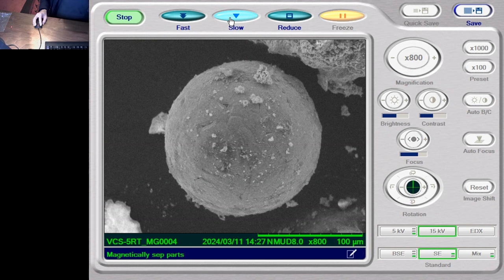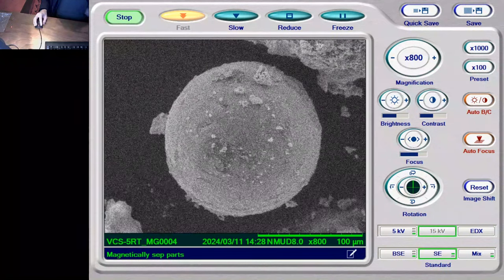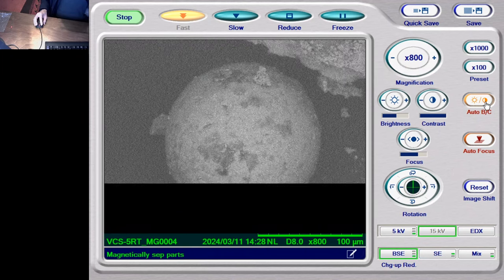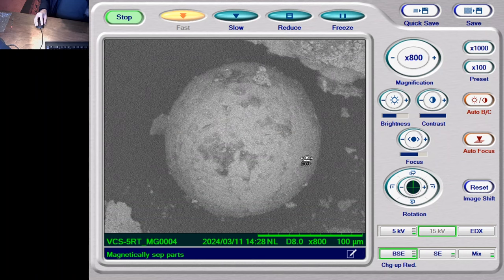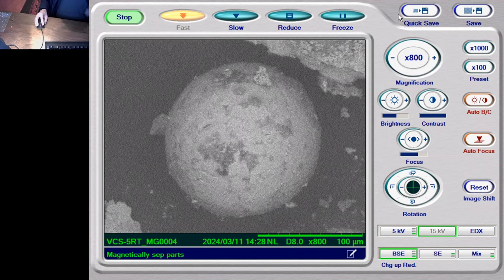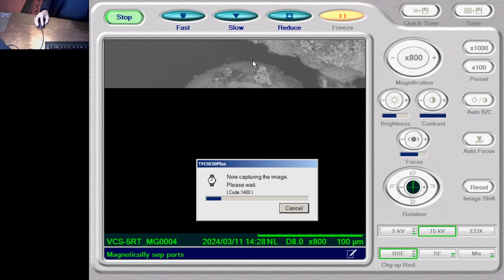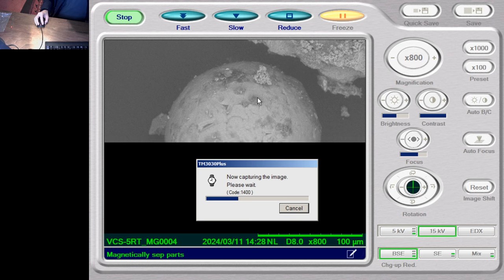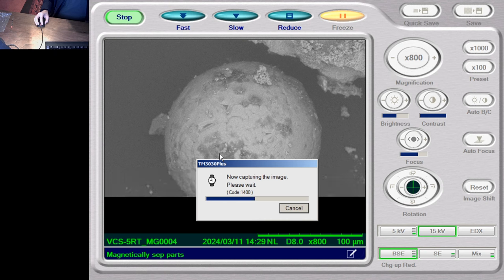Let's see how this appears when we put it over onto backscattering, see if we actually get anything here. Okay, so there is some difference in image that shows there are different elements here, but mostly it's the same element, whatever that is. Now this is darker, so this might be carbon, because the carbon is in the background there. So we will take an image of this, since it gives us the elemental changes. Now is this a heavier element? This could be copper here. Maybe this is iron mostly, and then these are carbon or silicon deposits on here. Who knows? We shall see.